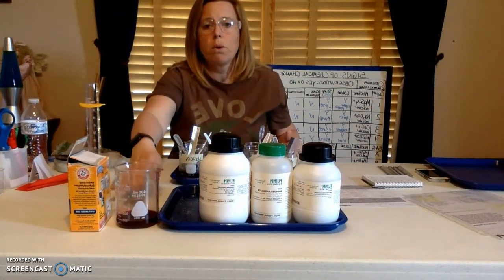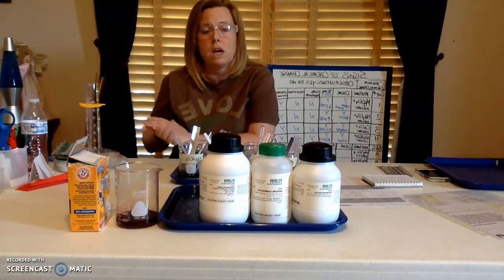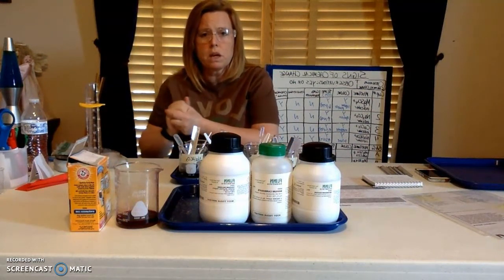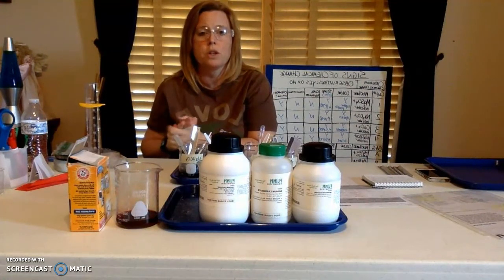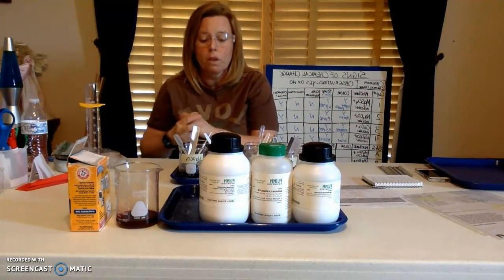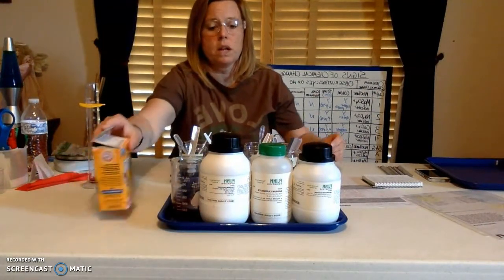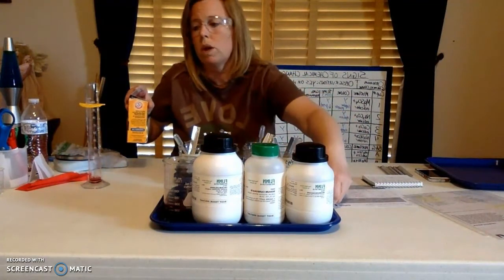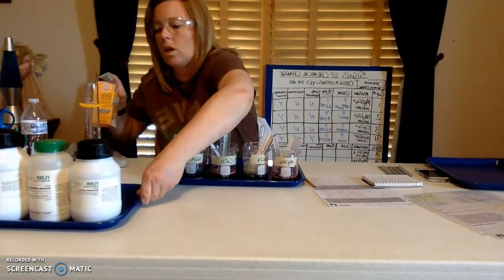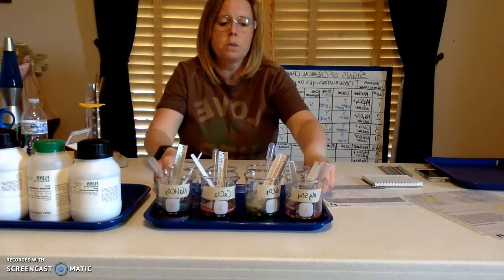I boiled that with distilled water because distilled water does not have any of the impurities, so to speak, not unhealthy impurities, but minerals and the such that are naturally found in our tap water. So that's the background of the materials that I used. As you can see, I have to purchase these from my chemical company. And this is the first part of the lab, and this is what I did.